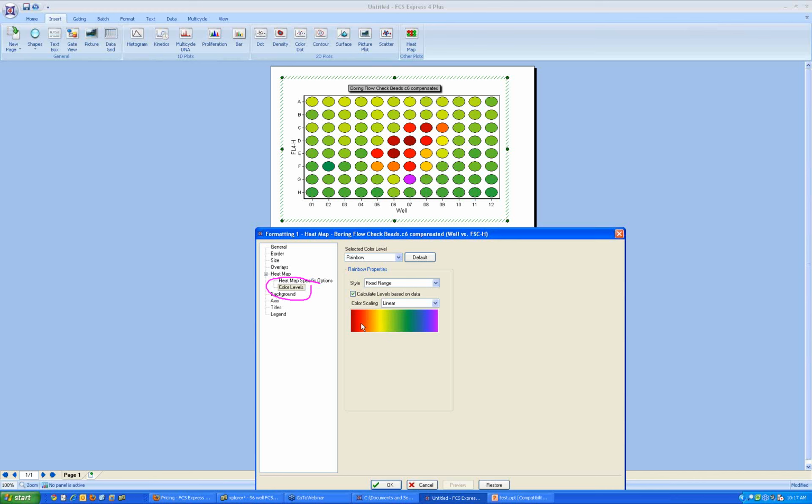So it's the same as any other logarithm. If you've got a very high dynamic range of data, with a lot of very high data and a lot of very low data, you may want to space the levels logarithmically. Okay? So again, a ton of choices for the coloring, so you can really get out what you want.